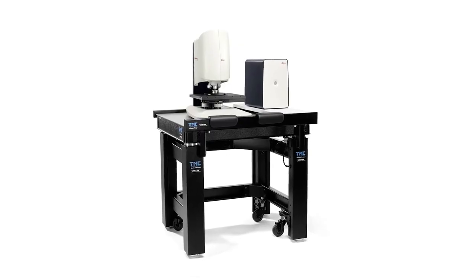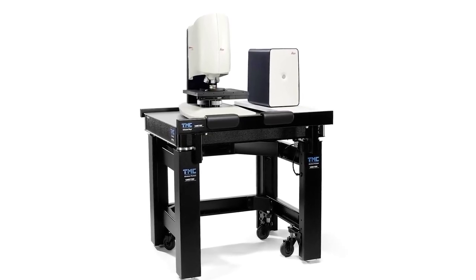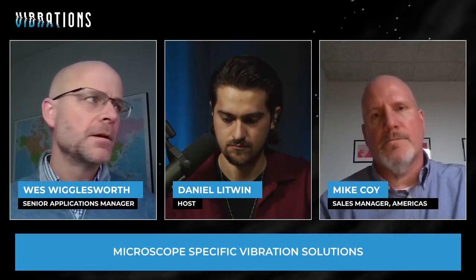So these are workhorses in a life science lab or a materials metrology lab, and based on our experience and knowledge of the instruments, a pneumatic isolator is more than enough for that type of microscope. Sometimes even a nice solid workbench is enough for some of those lower magnification light microscopes.